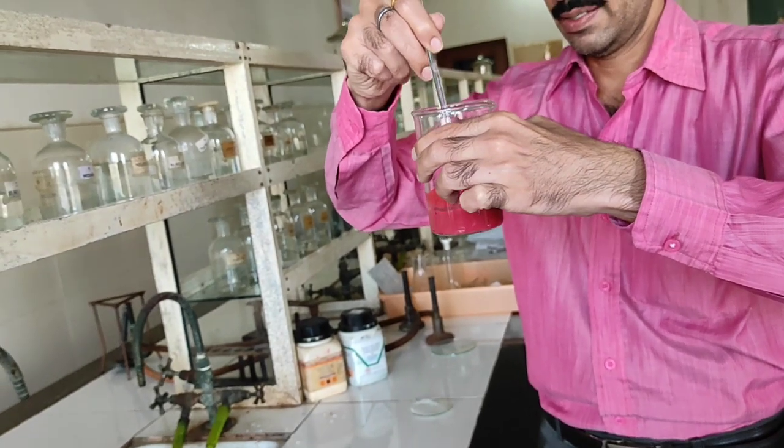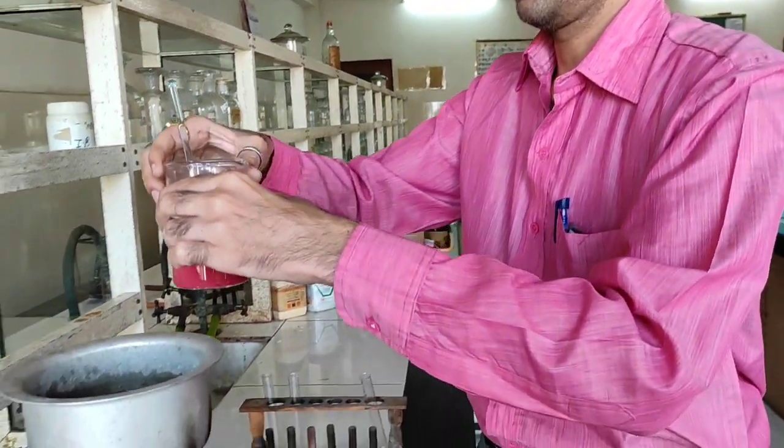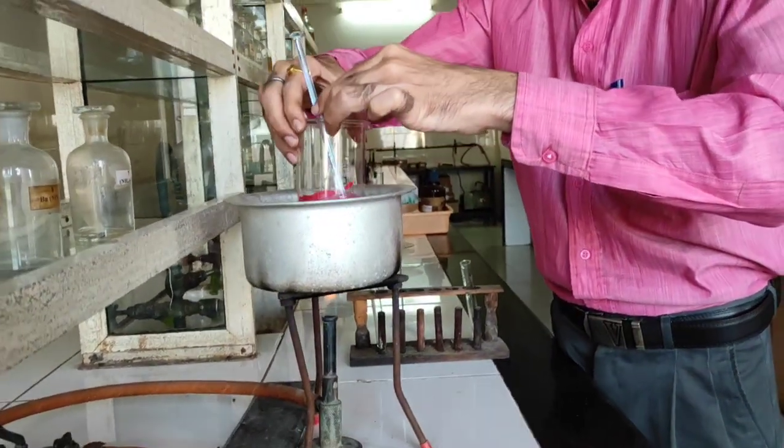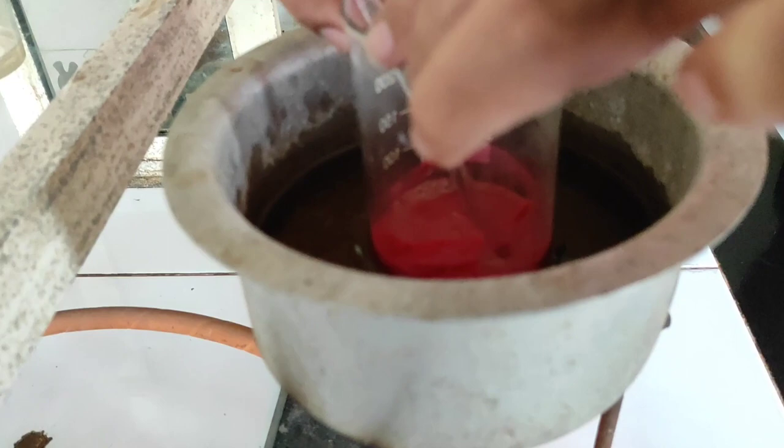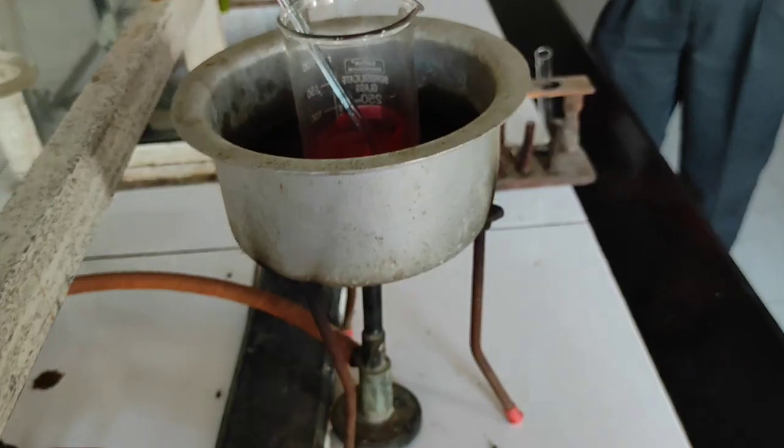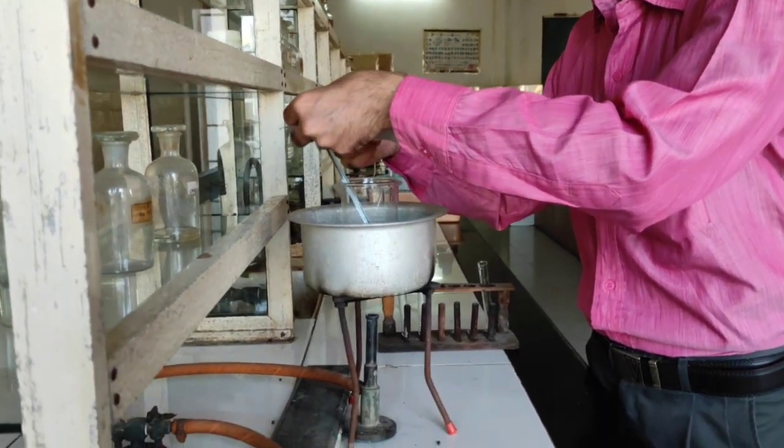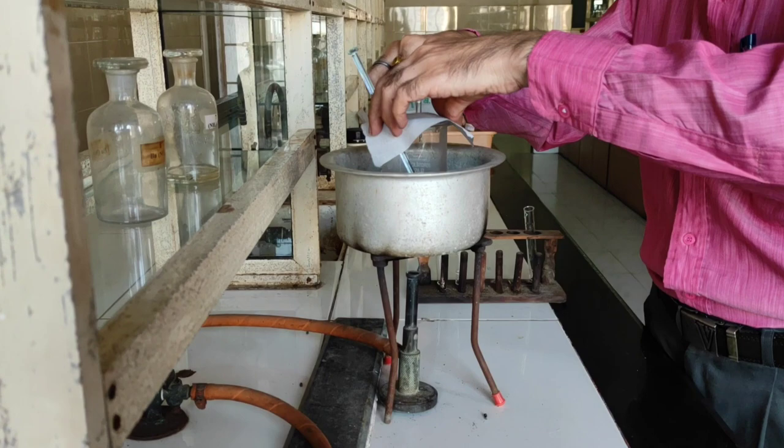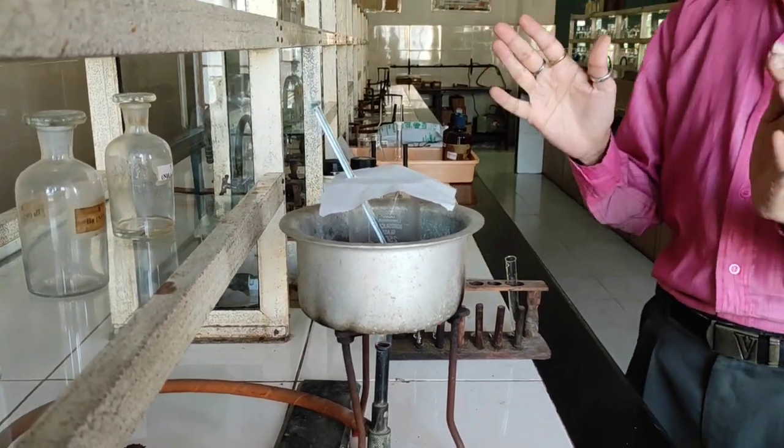Now the next process is we are proceeding for a process of digestion on a boiling water bath. So here we have the boiling water bath with a pipe clay triangle inside that so that it will hold the beaker firmly. Also we will be using a normal filter paper to ensure that no impurities can penetrate inside the beaker. This process of heating has to be carried out for 30 minutes.